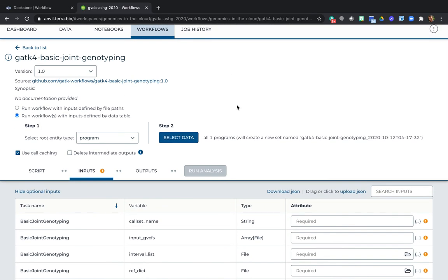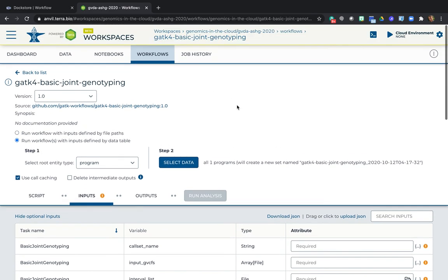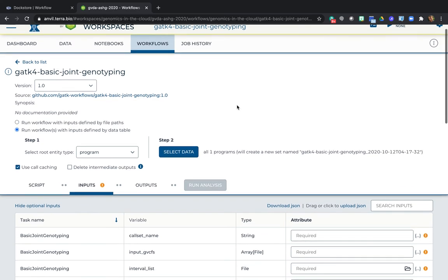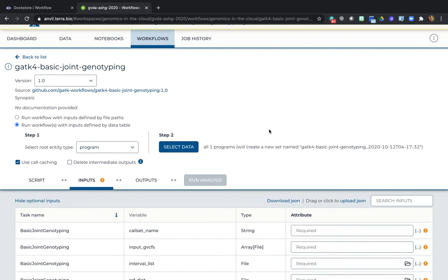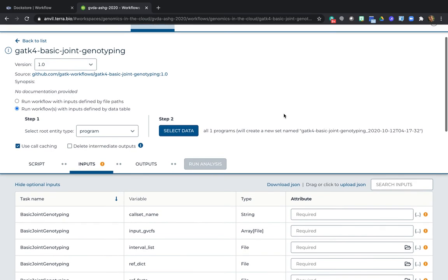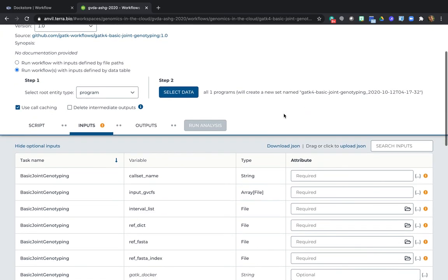So at this point, you have the workflow that's been imported into your workspace. You can't actually run it yet because you still need to configure it, meaning you need to specify what data it should run on, specify some parameters and so on. And that is what we'll cover in the next tutorial.